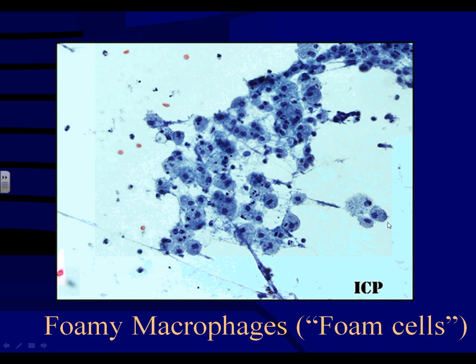Foam cells are multivacuolated macrophages that are not uncommon in a breast FNA, especially in those with cystic change. They're just typical foamy macrophages you've seen at other sites — in the breast we refer to them as foam cells.